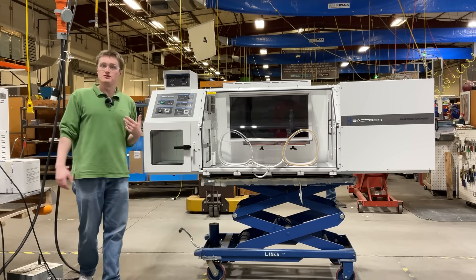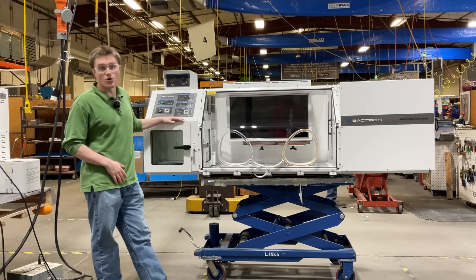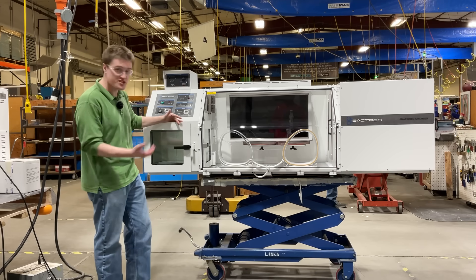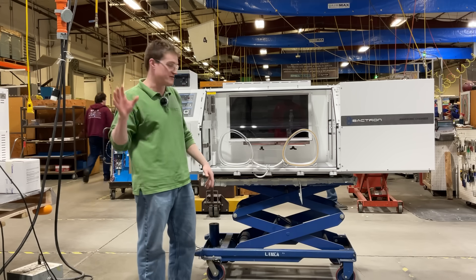Now let's take a look at some of the features located inside the unit. The first thing that you will see is a spacious pass box or airlock to allow you to introduce samples or components into your chamber without exposing the workspace to the outside atmosphere.